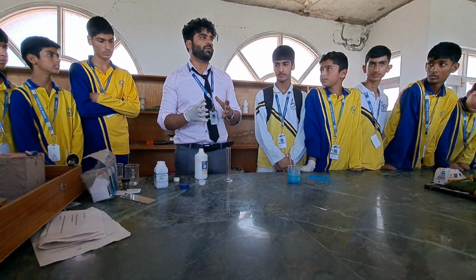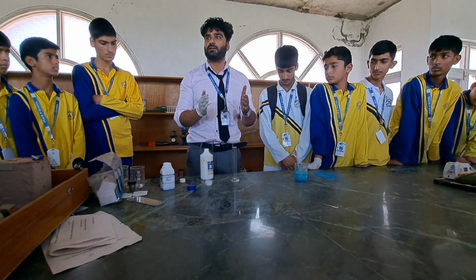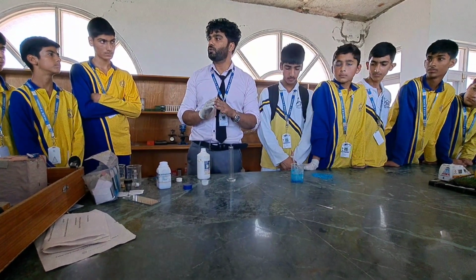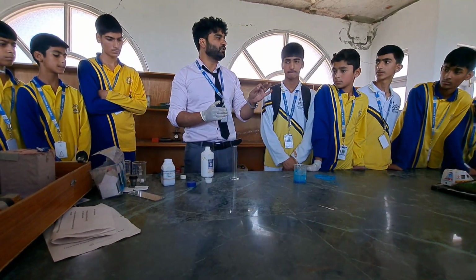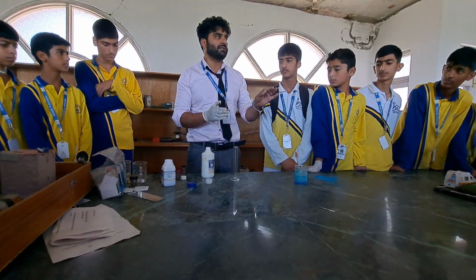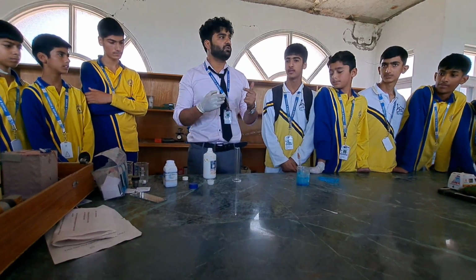As you know, students, I have taught you in the classroom the reaction of the metals with the acids, and I have given you so many examples of reaction of the acids with the metals. The prominent and the most common example of reaction of metals with the acids, I have taken the reaction of sulfuric acid with the zinc. Can I ask you a few questions?